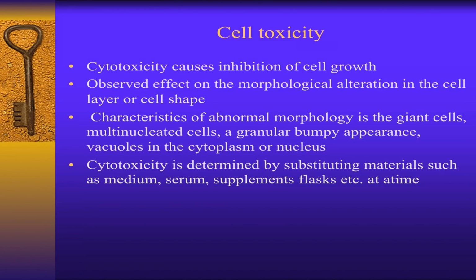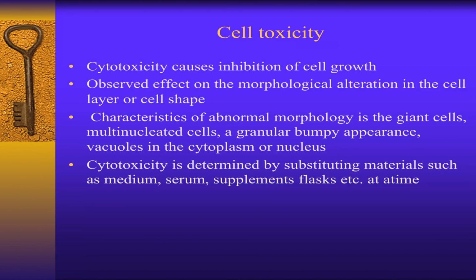We have to add about 20 microliter of MTT, and incubate again for 4 to 6 hours. Why are we adding it? The function of this MTT is that it goes and attaches wherever the live mitochondrial dehydrogenase is present inside the cells. Only live cells possess this, so wherever it is, the MTT will go and attach there and form a complex.